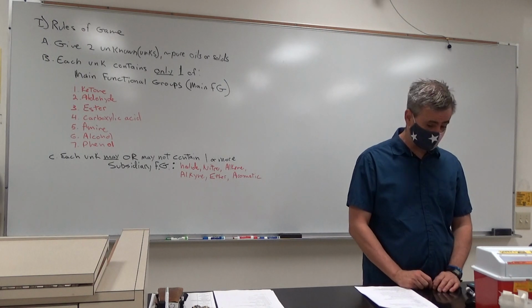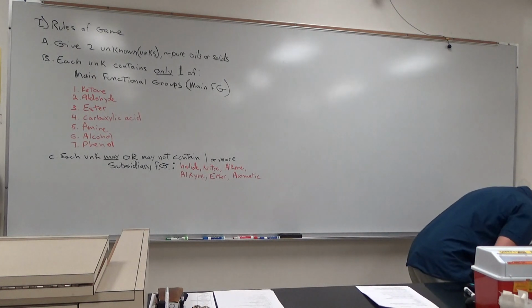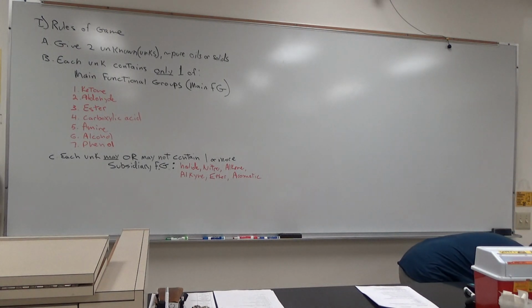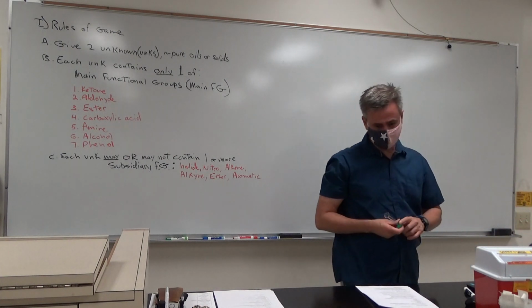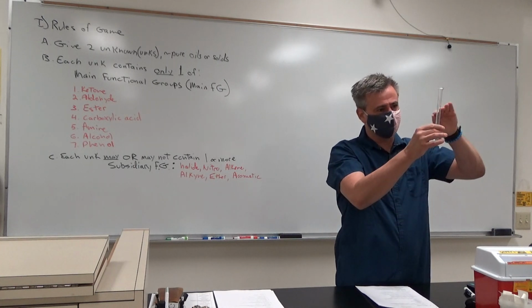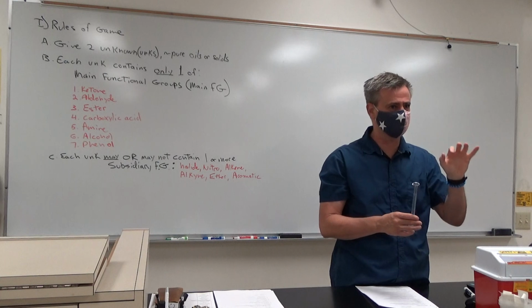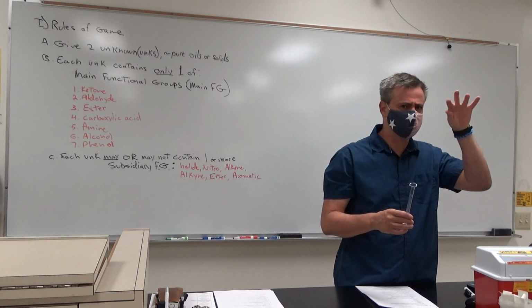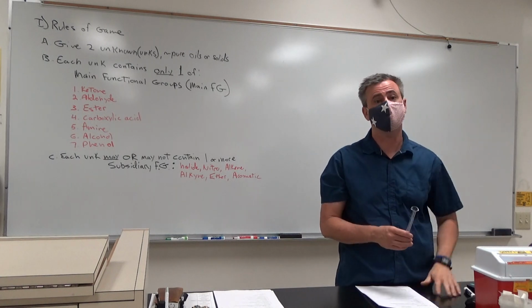A nice little trick: sometimes if you have an oil, the meniscus can make a funny diffraction, and it looks like, wait, is that just a meniscus visual thing, or is there oil sitting on top of this water?